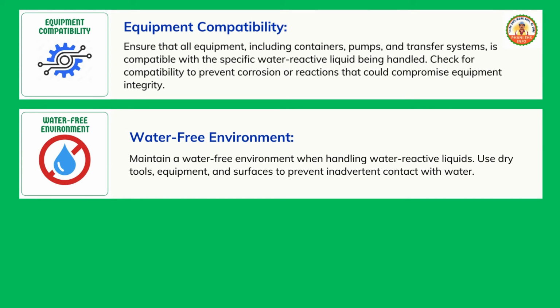Water-free environment. Maintain a water-free environment when handling water-reactive liquids. Use dry tools, equipment, and surfaces to prevent inadvertent contact with water.